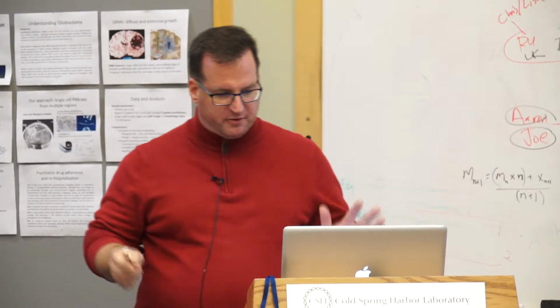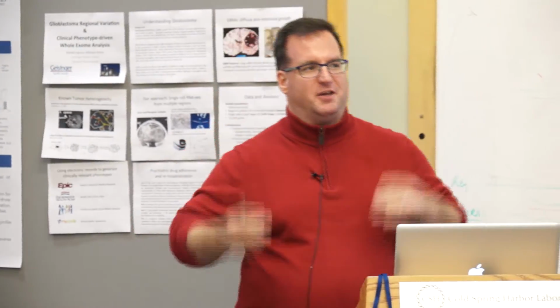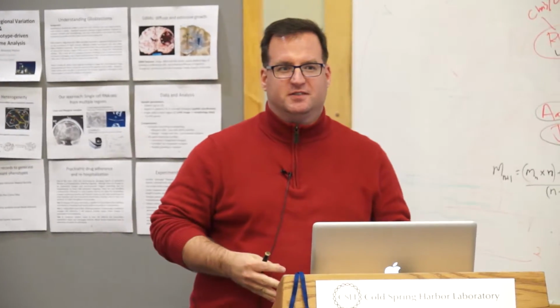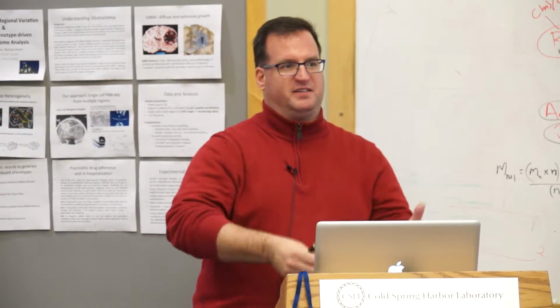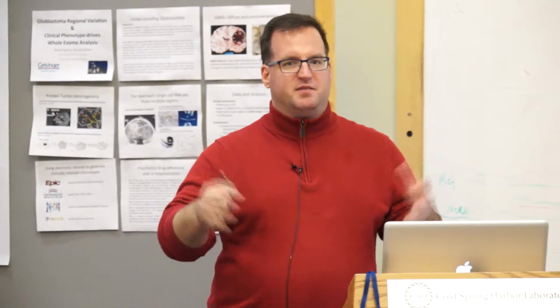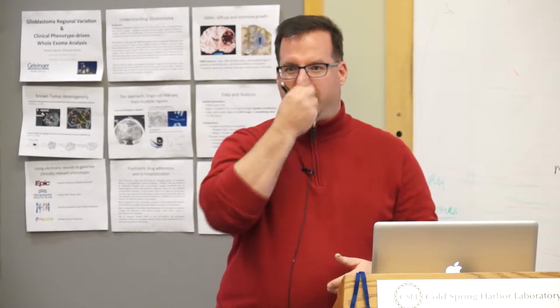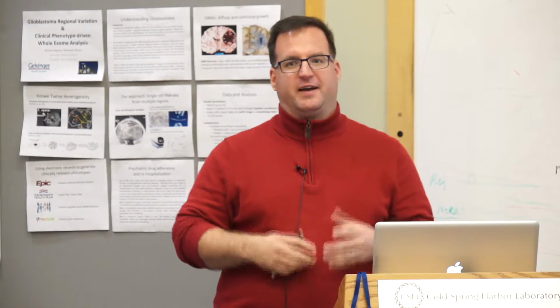So we're going to talk about what happens once you've got through all of this bioinformatics business and you actually have a result. Okay? You have a list of peaks, or you have a list of genes, or you have a list of SNPs, or you have some list of things that your genomics experiment generated that you need to now consider. What the heck are you going to do with it?